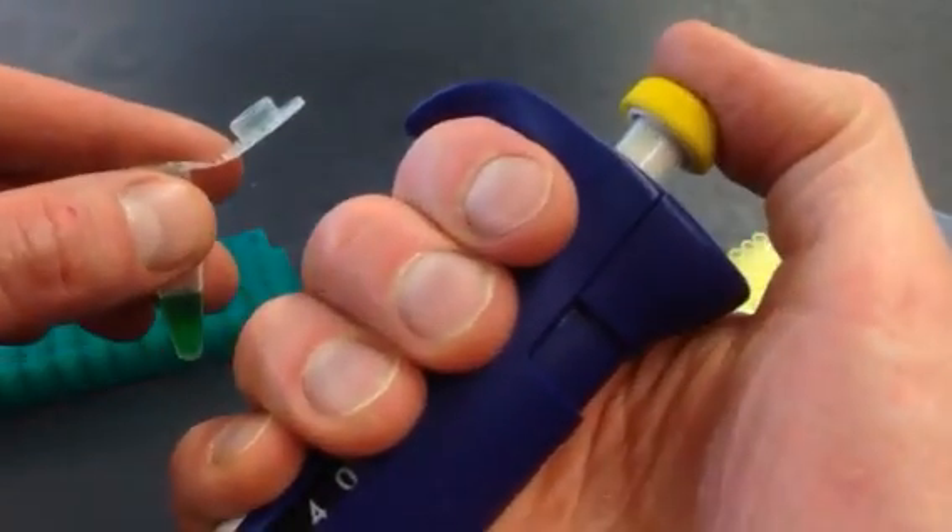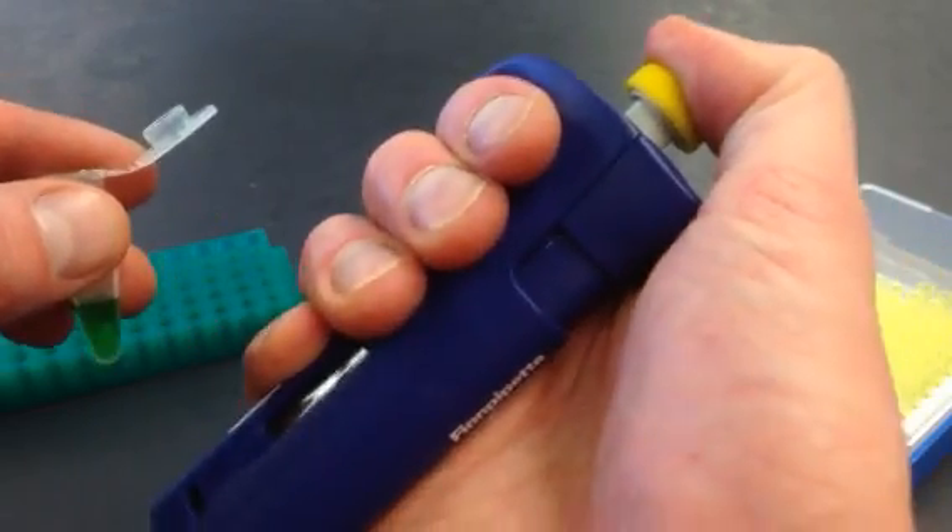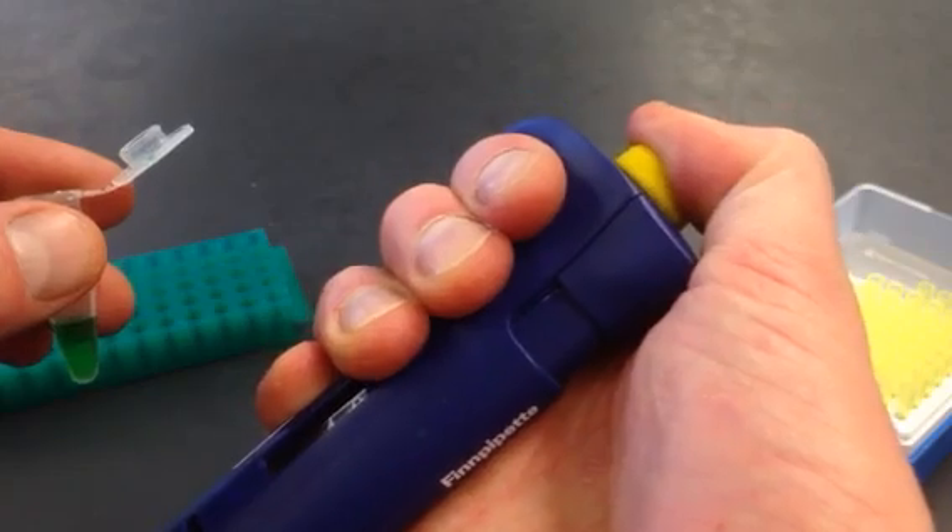Here's an important tip: when you push down on this little plunger, you can push it down gently until the point where it stops. If you force it down further, you can push it all the way, but you don't want to do that.